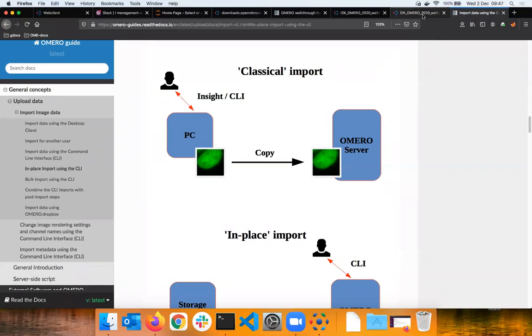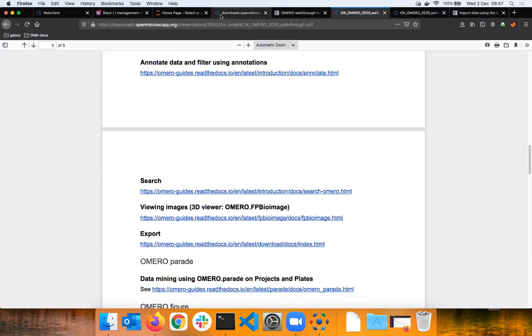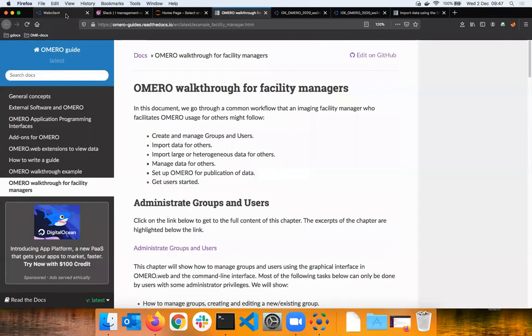Very good, thanks. So this is what we wanted to show regarding the import. And now again the big switch. Don't get dizzy from that. I will slowly but surely be drowning in my tabs. I will close some. Pardon me for that.